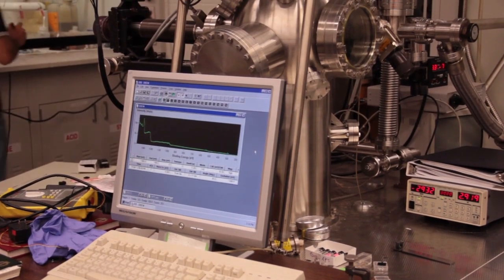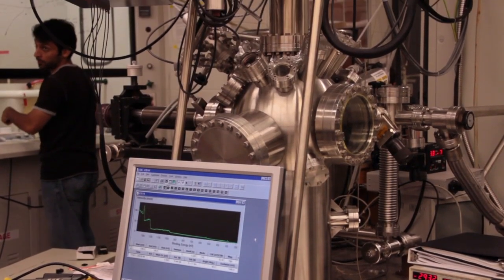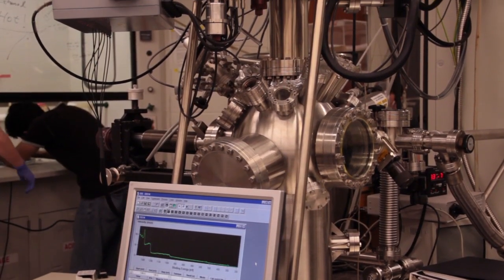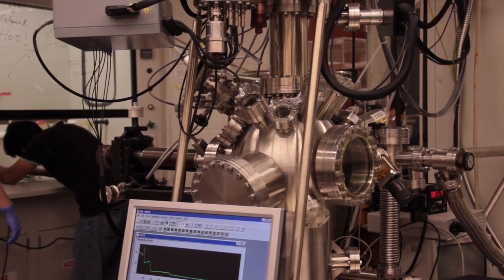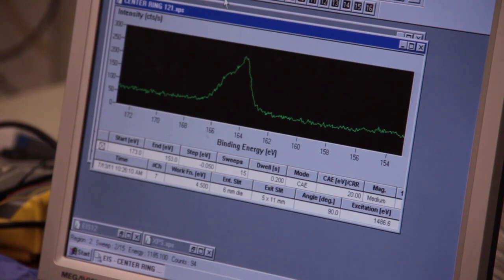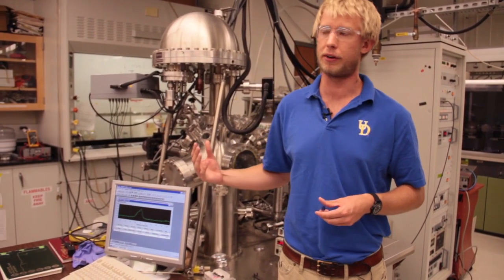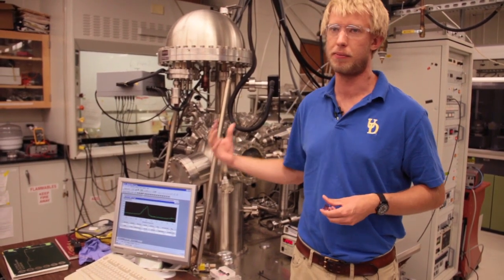The unique thing about P3HT-PCBM is it's an interface of two different polymers - one which has sulfur atoms along with carbon and hydrogen, the other which only has carbon and hydrogen. Using this beam we can tell if we have sulfur or if we have carbon and hydrogen. This peak right here is due to sulfur, telling me that I'm looking right now at a P3HT polymer.